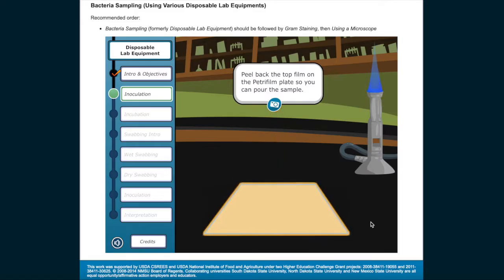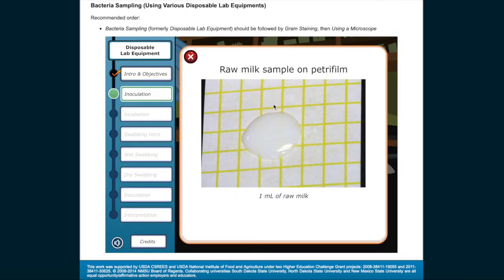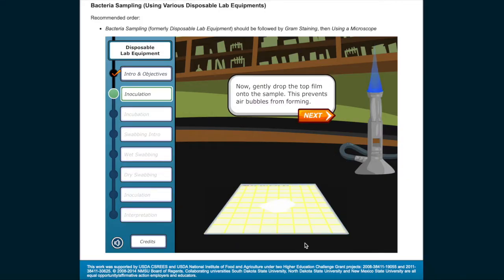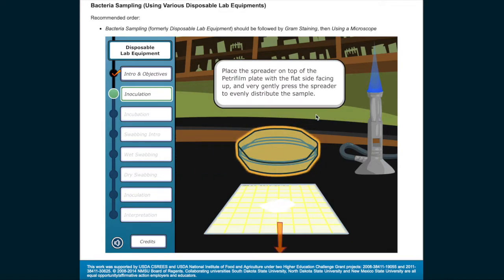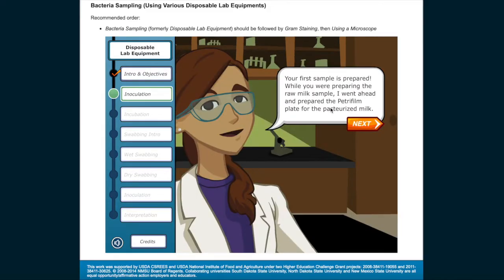Peel back the top film on the Petri film plate so you can pour the sample. Now gently drop the top film onto the sample — this prevents air bubbles from forming. Place the spreader on top of the Petri film plate with the flat side facing up and very gently press the spreader to evenly distribute the sample. Your first sample is prepared.